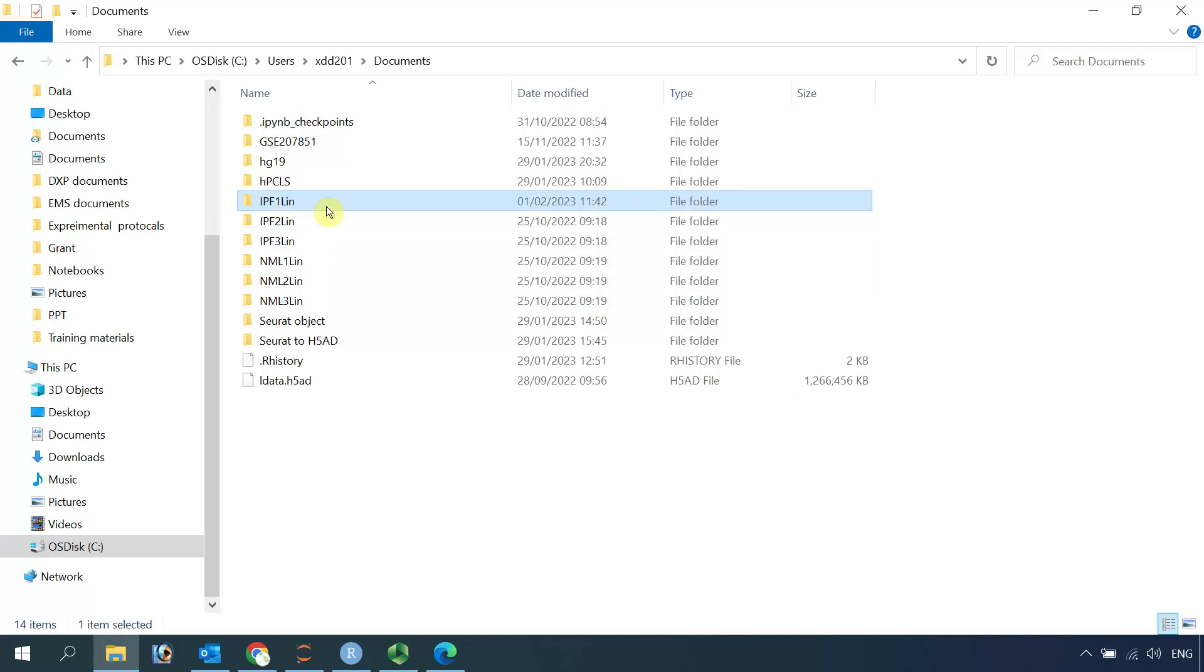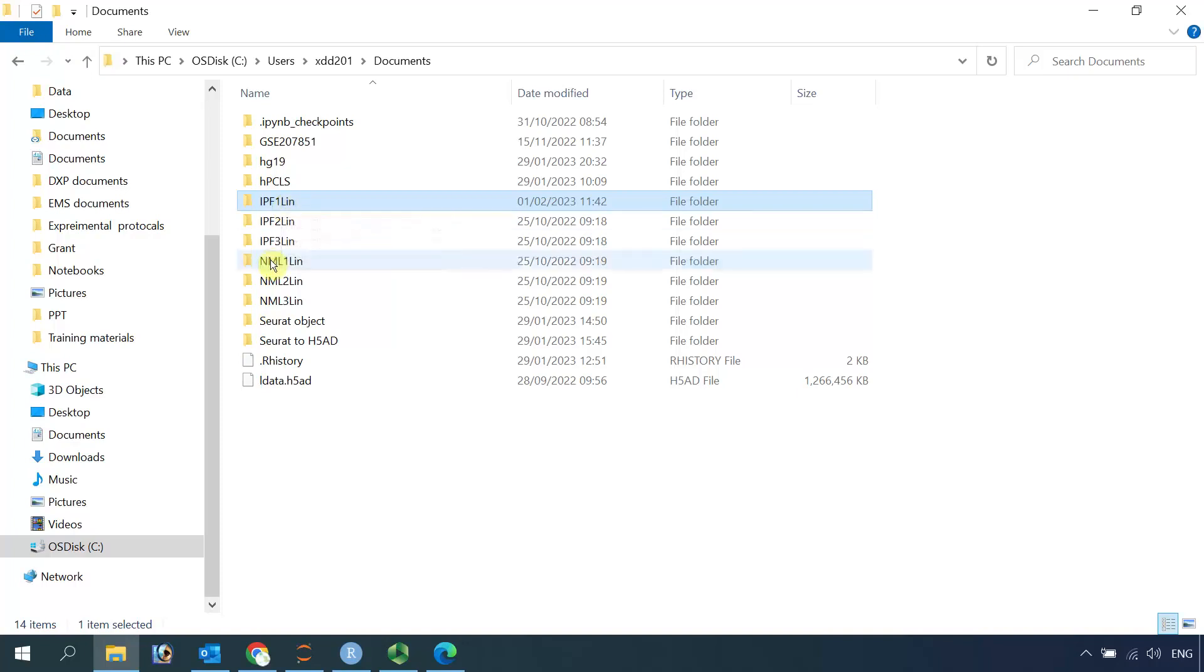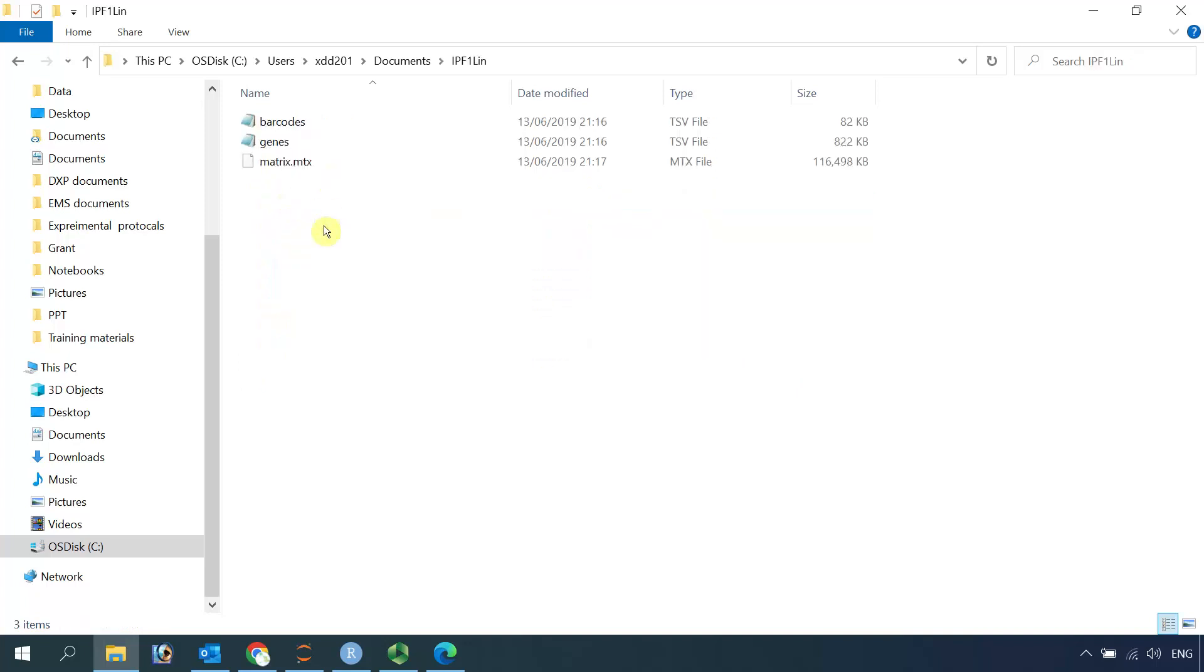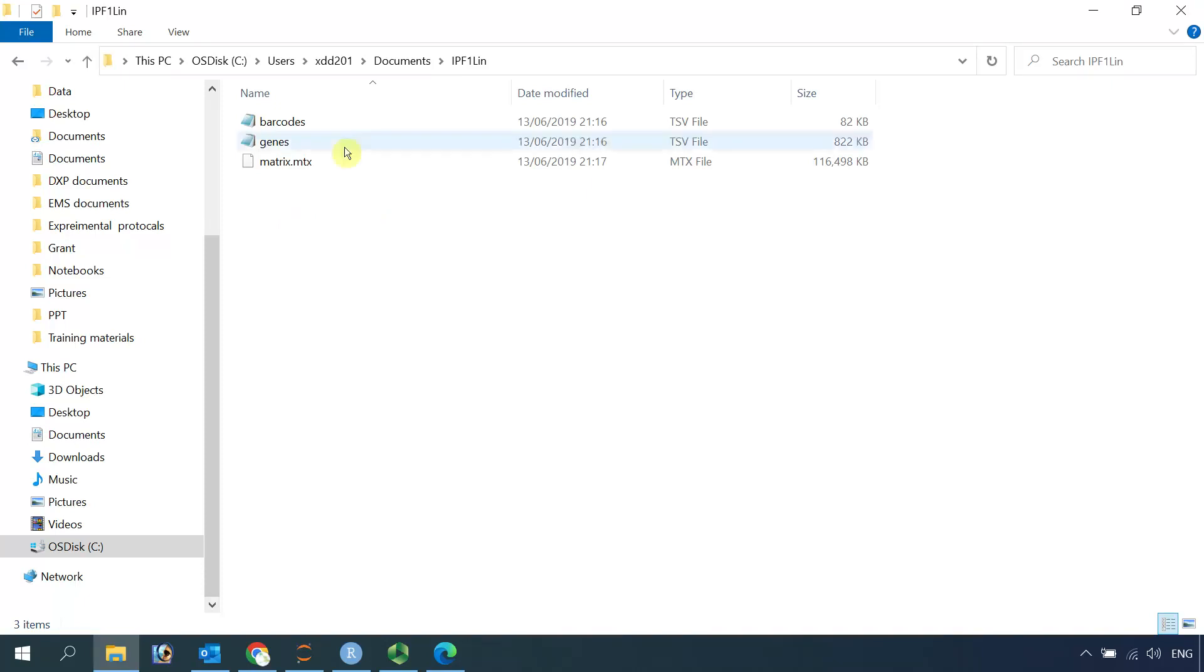Today I am going to use the dataset IPF1-LIN for the demonstration. This dataset is one of three repeats for fibrotic human lung single-cell RNA sequencing data analysis. So if we open this folder, you can see we have the barcodes, genes and the matrix data here.